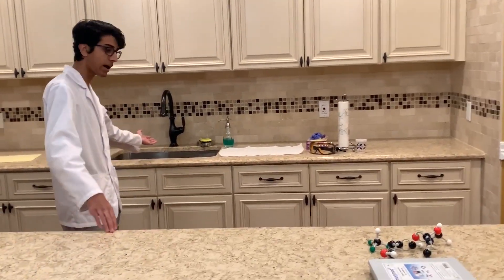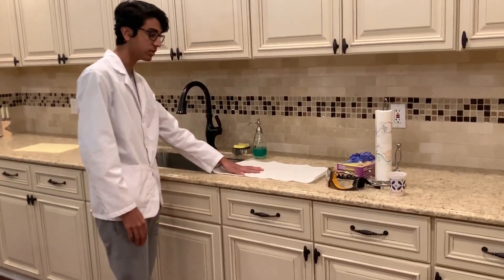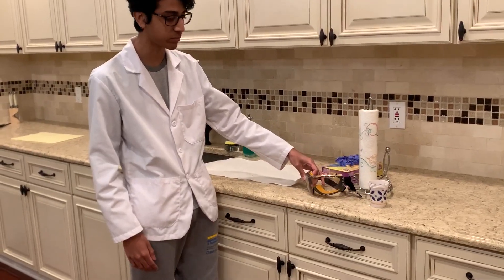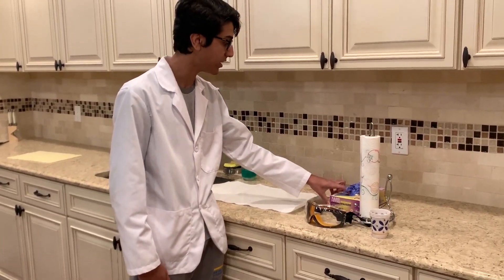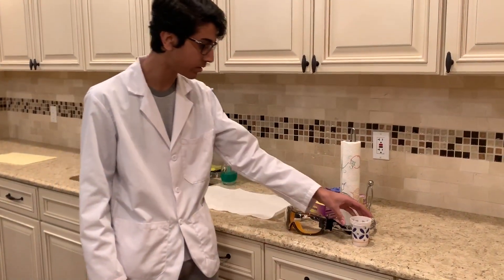Over here, I have a sink for washing the glassware and stuff, a little bit of a drying area. And then goggles, protective eyewear if necessary, nitrile gloves, some paper towels for cleaning stuff up around the lab.